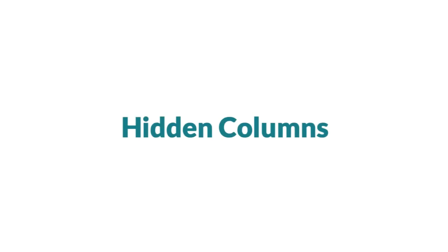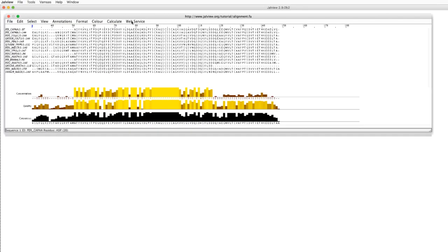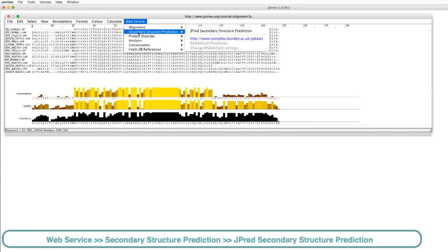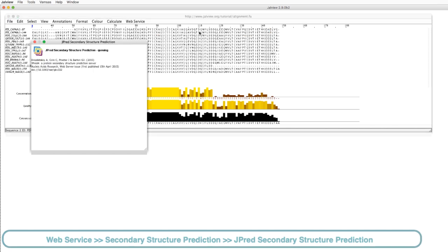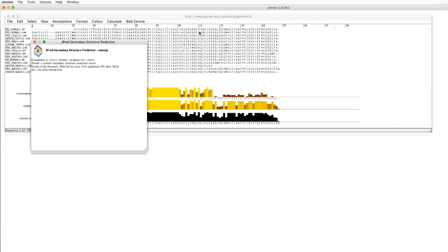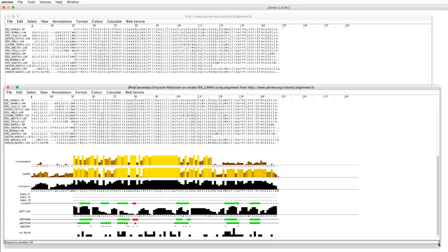If columns or part of the alignment is hidden, they will be excluded from the alignment that is sent to the JPRED service. The prediction results from the service will be mapped back onto the visible part of the sequence to ensure a single frame of reference is maintained.